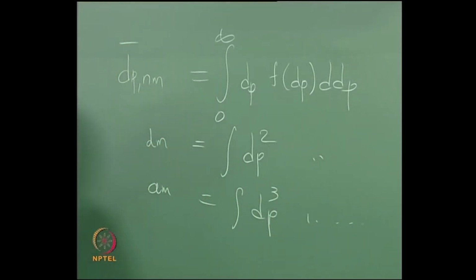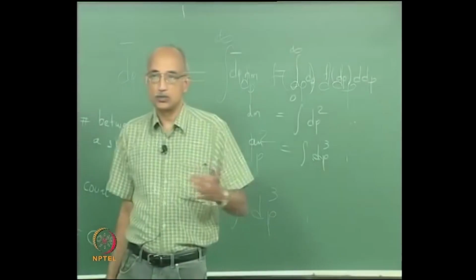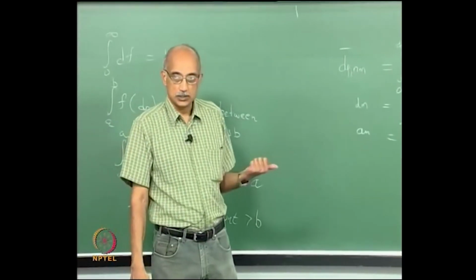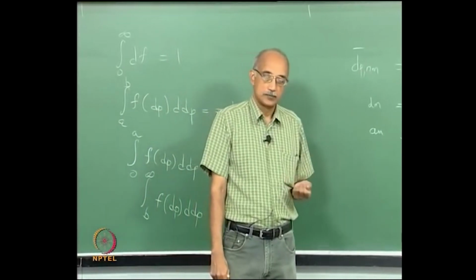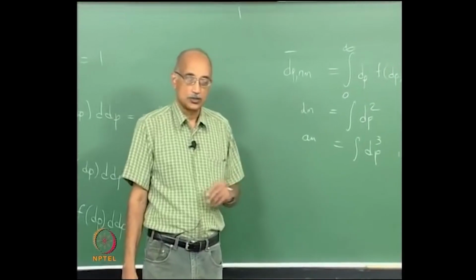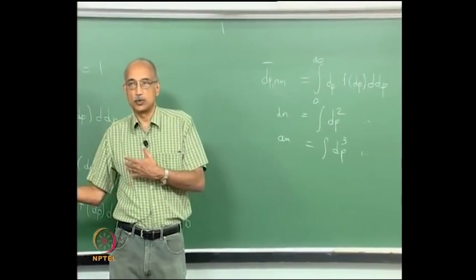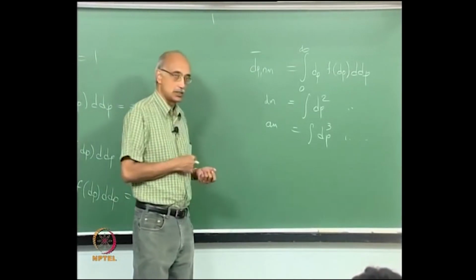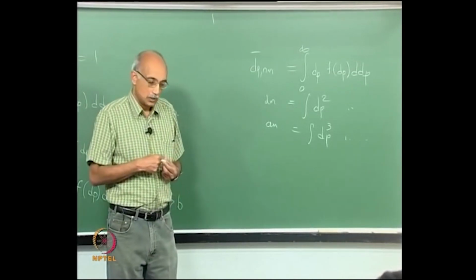So these are essentially the continuous function counterparts to the differential analysis of mean size that we discussed in the last class. And of course the variations or the standard deviations can also be calculated accordingly, both for the discrete form of data as well as the continuous representation of particle size distribution.